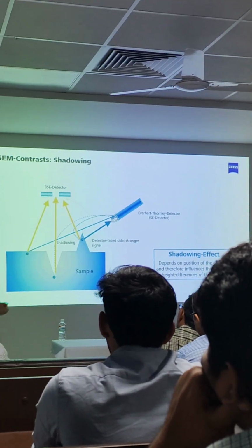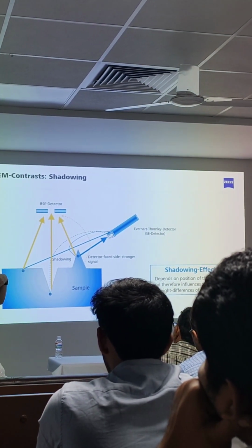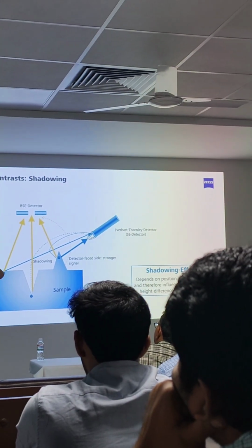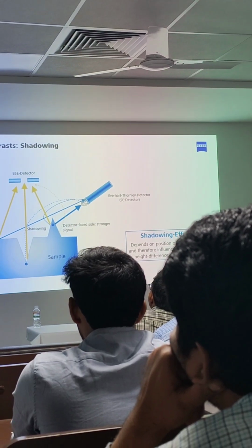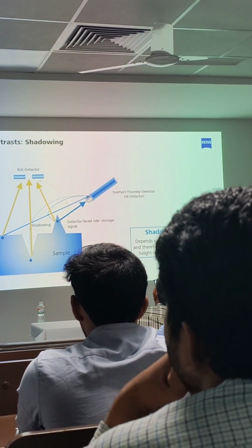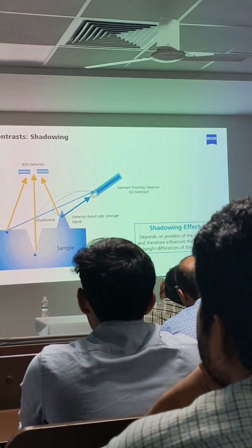I know some of our clients are very crazy about it. They say, I have a lot of money, please put more detectors so that they maximize our 14 ports. They just want to add this, please. Our salespeople will be very happy. But what kind of information do you want, right?